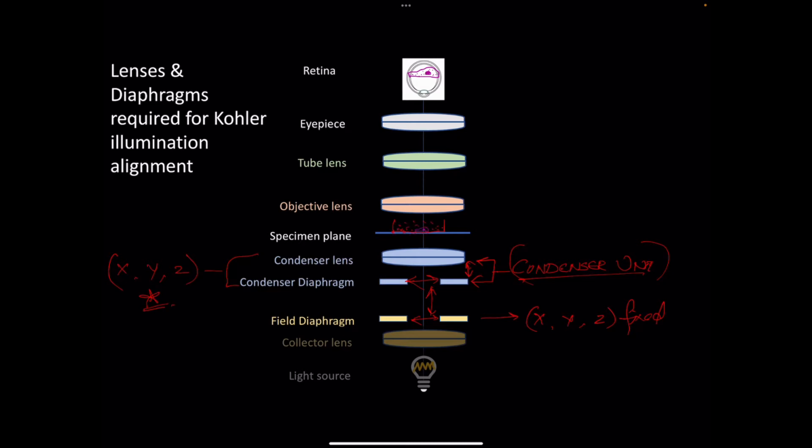There are sample cells lying here and there, everywhere in the dish. So basically you have to move to different parts of the imaging dish and image different cells. It's not that you're going to image a single cell. You're going to get different parts, and in order to do that, you need to have the freedom in x and y and z also. In some microscopes, you can modulate the position of the specimen plane, so you have freedom there. After the specimen plane, if you want to move to some other part of the imaging plane, you can move the sample in x, y and z direction.